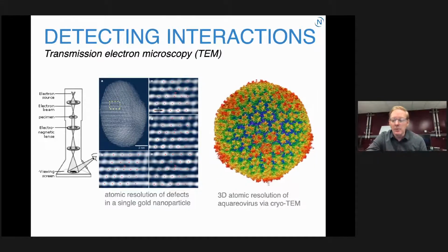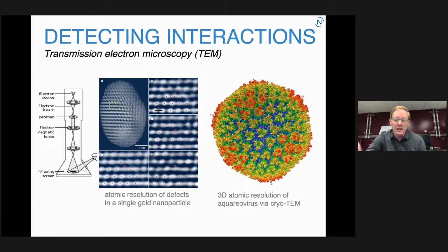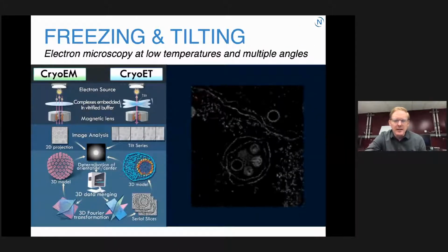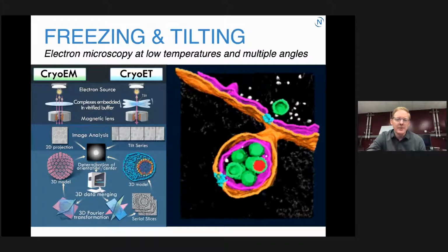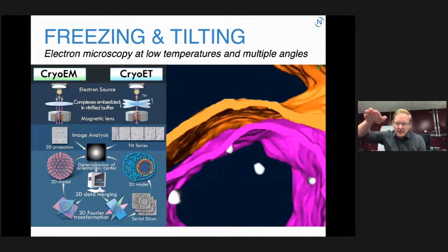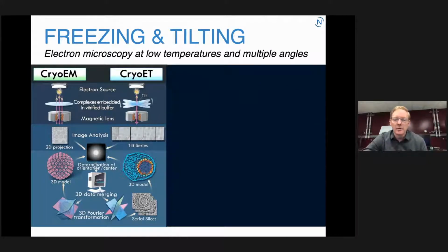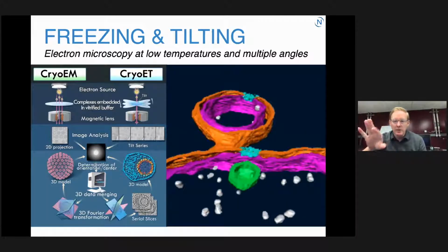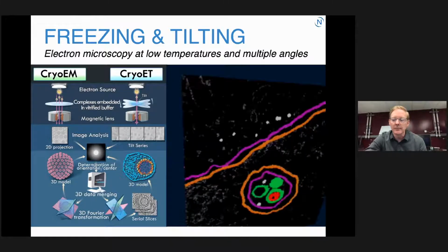And this was another technique that won a Nobel Prize a few years ago for what's called cryo electron microscopy. Cryo meaning cryogenic. It's done at very cold temperatures. And then we are pushing new techniques forward, again, not only in cryo-electron microscopy on individual particles, but also in what's called tomography, where instead of just looking at a sample at one angle, we can tilt it and slice through it and generate three-dimensional structures through various different types of materials, looking at it from every different angle. So this is called tomography. This is a technique that's very much emerging here.